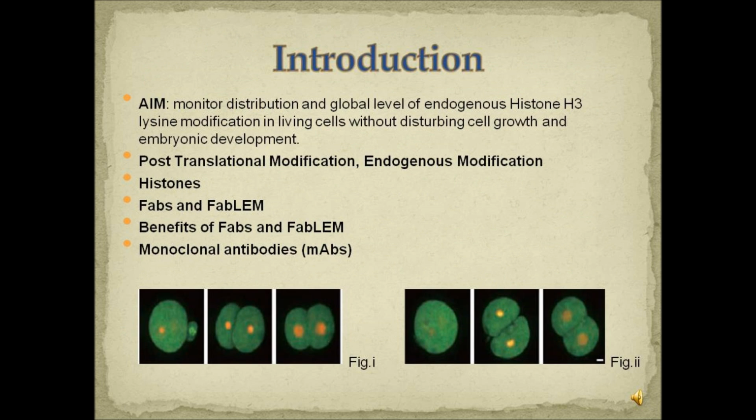The main aim of this research is to monitor the distribution of endogenous histone H3 lysine modification in living cells without disturbing cell growth and development. Histone proteins have to undergo several modifications in order to become functional.